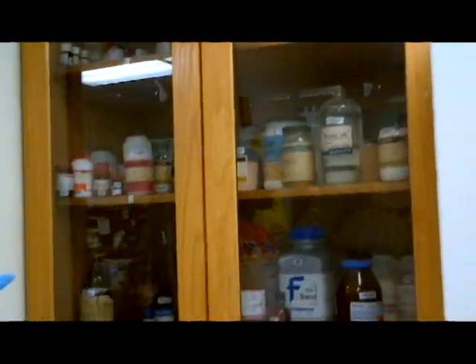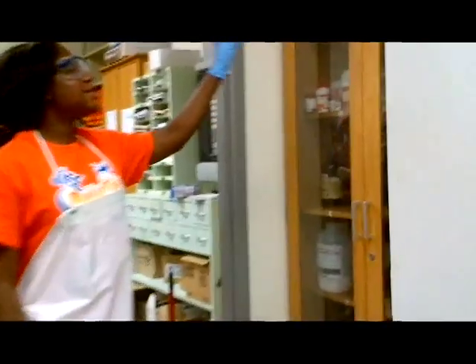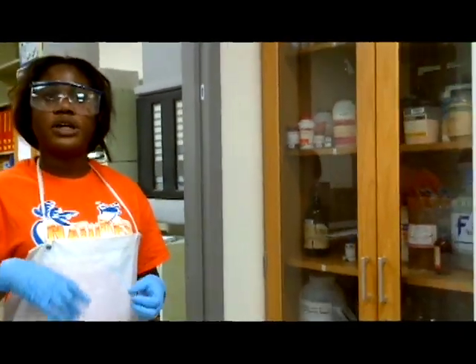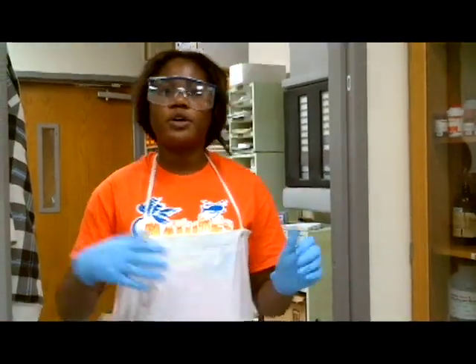This is the cabinet C, which contains most of the chemicals that I'll be using in the lab. And for organic chemistry labs at UTA, before you come to your lab, in writing your notebook, you have to include material safety data sheets for every chemical you're using, so you can know what's hazardous about the chemical, so you can know how to handle it properly. And you can also know how to put in the right locations, because some chemicals are easily flammable and you don't want to put them over a burning fire.